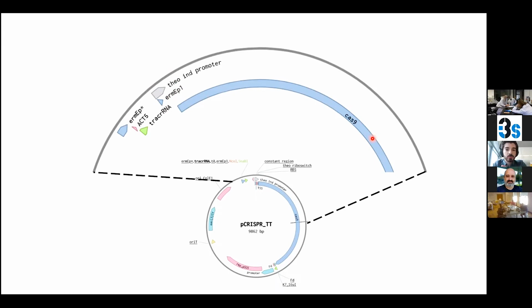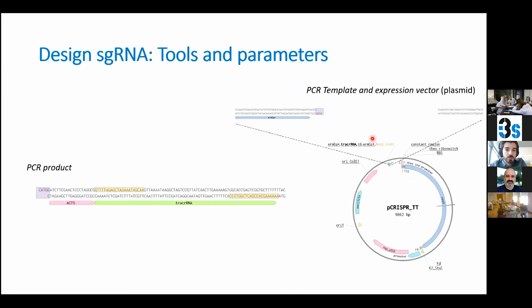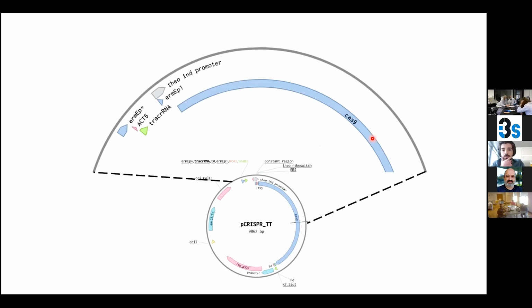If the people want to follow exactly this explanation that you have given now, we can send the PCR sequence or segment, this PCR product, and people may want to clone these by themselves in the different labs if they want. Okay, they just performed the final step of the thing, that is triggering the Cas9 system inside the bacteria.